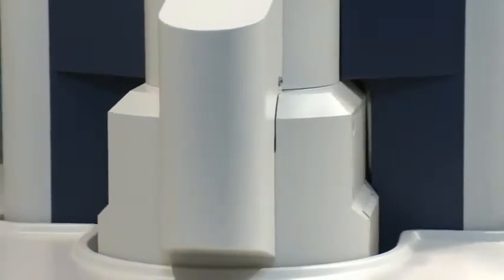One of the key technologies of the Hitachi HT7700 is a screen viewing camera that has far greater sensitivity than that of the human eye.